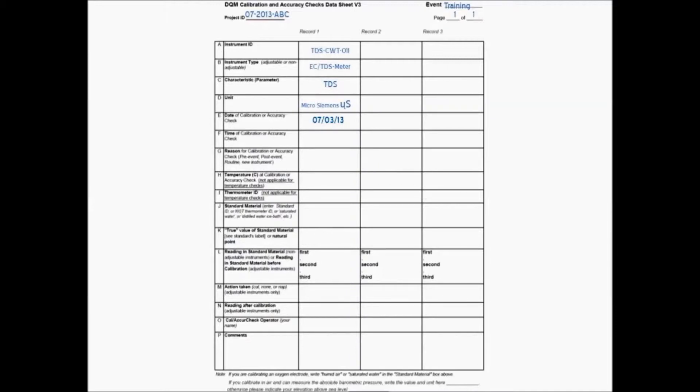The reason for the calibration is to support training. It's important to record the temperature of your calibration solution at the time you conduct your calibration. Also record the thermometer's identification or tracking number.